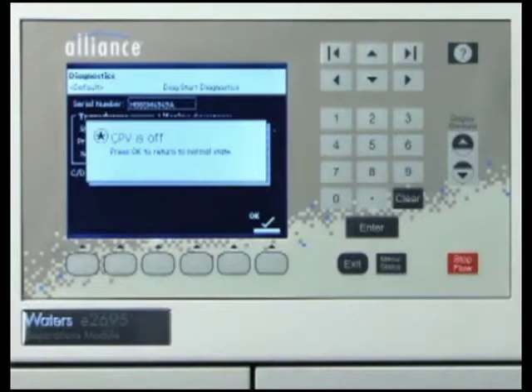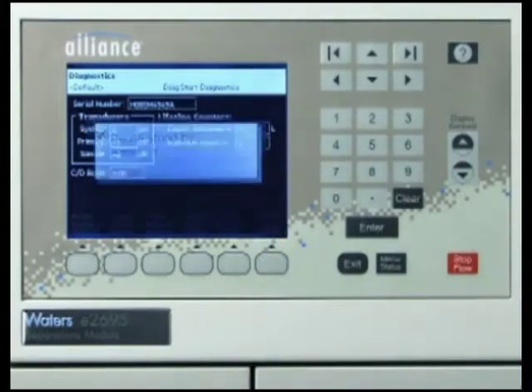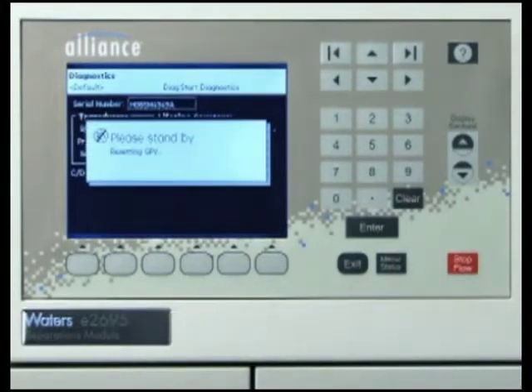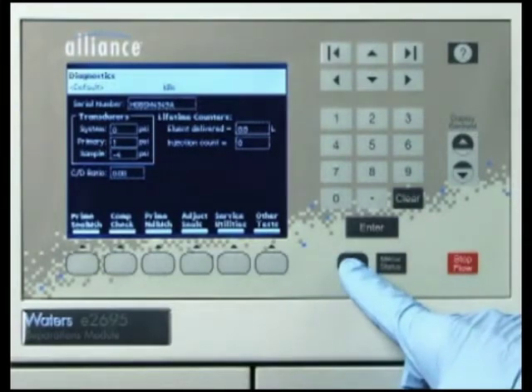Before continuing, it will be necessary to open the gradient proportioning valve. Press OK to return the gradient proportioning valve to its normal open state. You will be informed to stand by while the GPV resets itself. Next, press the exit key to exit diagnostics.